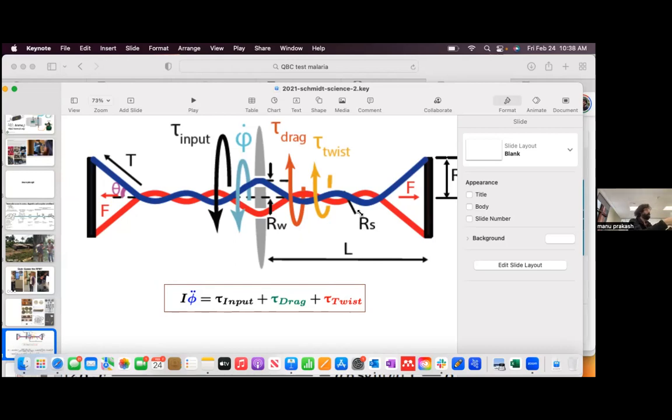So I'm going to load it a little bit. What I've now done is I've turned that into twist. That's the residual twist. It has one chirality because I twisted it this way. If this has right-handed chirality, this has left-handed chirality in a mirror symmetric fashion. So you can see that the twists go in a certain way when this thing moves in a given rotation. But now if I pull on it, you notice it spins, right? But now it's stationary again. That doesn't help that much if I have to keep loading.